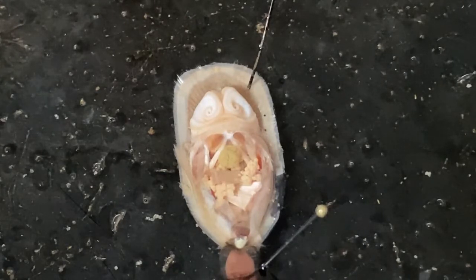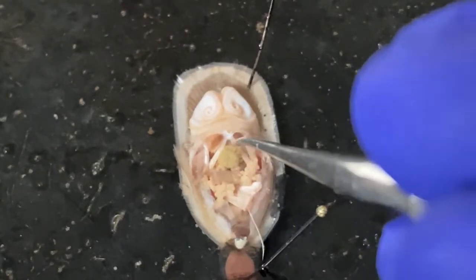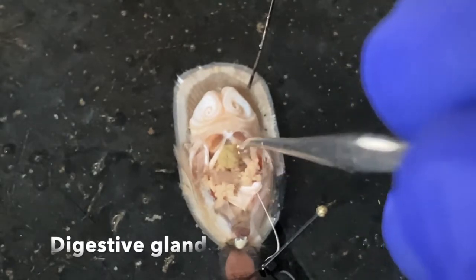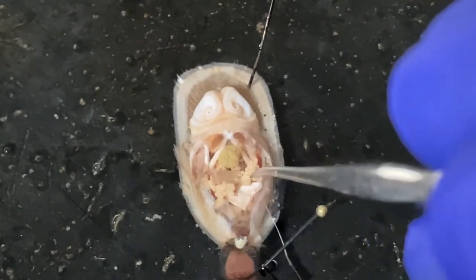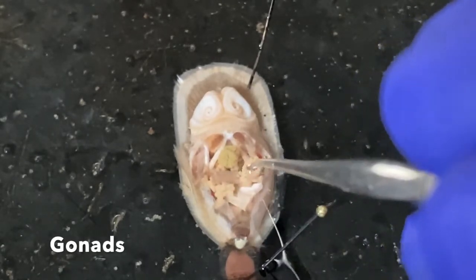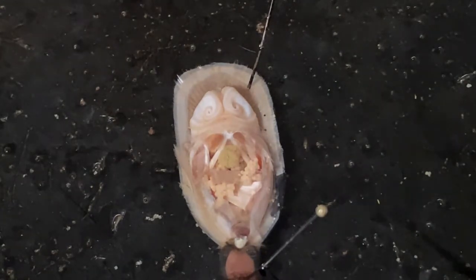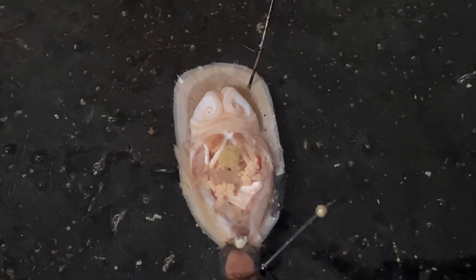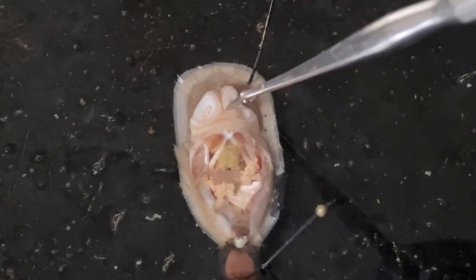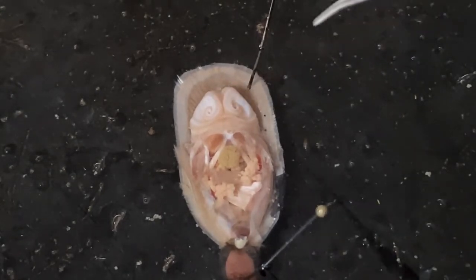Okay, let's take a look at what else we can see. Right here, this prominent green organ. You can probably guess what this is by now, hopefully. This is a digestive gland. And this yellowish, orangish material is gonad. Okay, the other prominent structure that we can see in this orientation is the mouth, which is a tiny opening located right here. There's the mouth right there, located between the two arms of the lophophore.